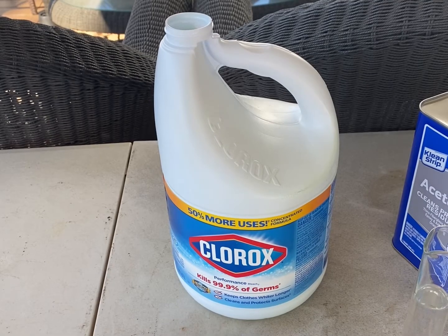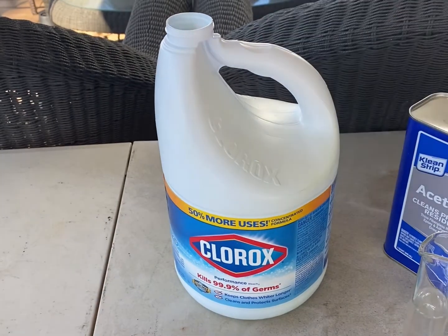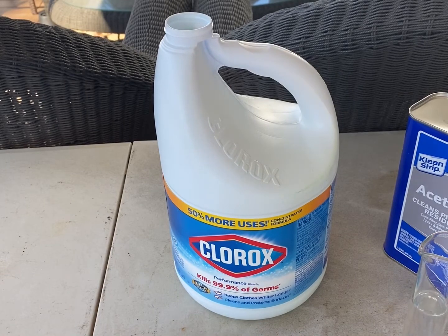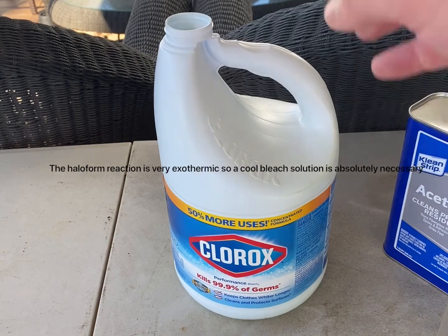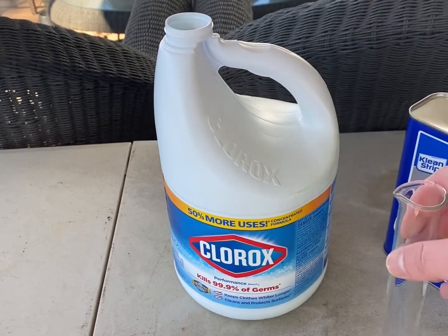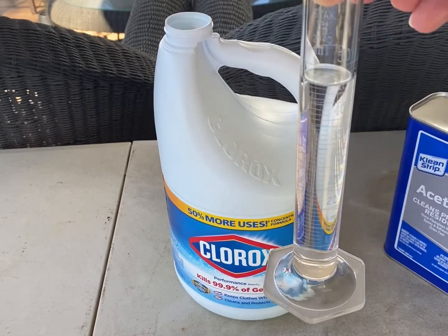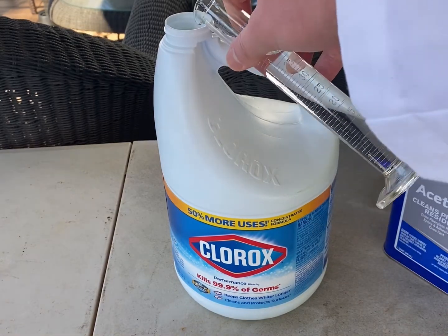We're gonna start the first experiment to make some chloroform. So we've got the acetone and the bleach, which is gonna be used in the haloform reaction to make chloroform, a trihalogenated carbon molecule. To start off, we have this bleach, which I cooled in my freezer for around 3 hours. And we're adding 90 milliliters of acetone in half fragments. So I've got about 45 milliliters here, and we're gonna add it slowly.